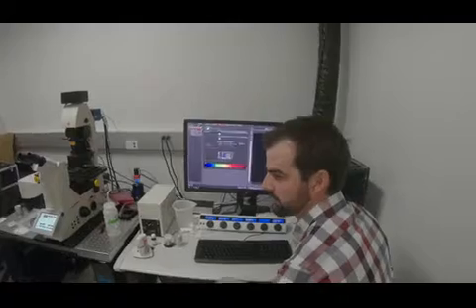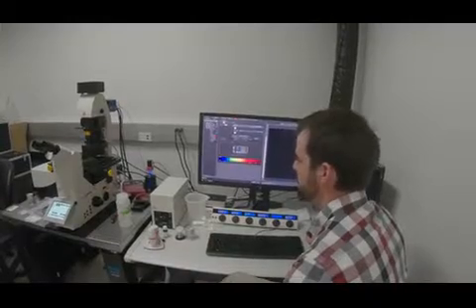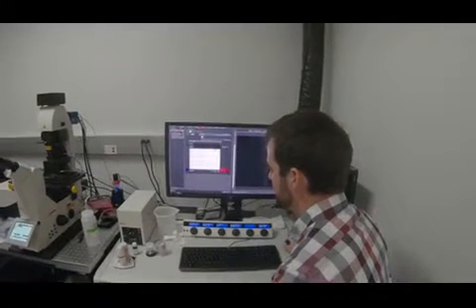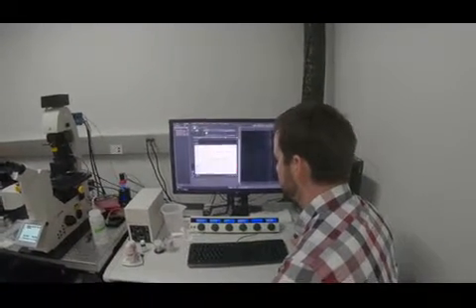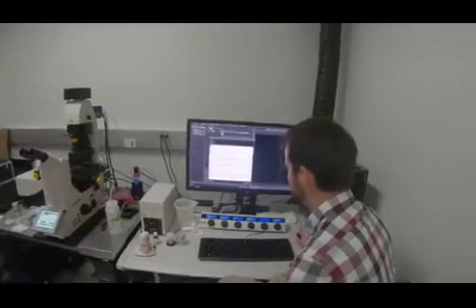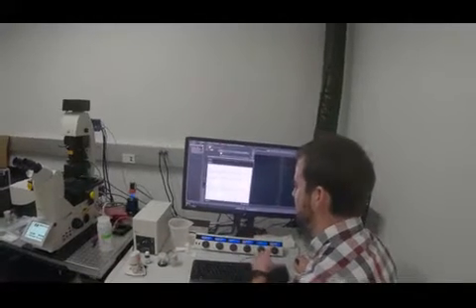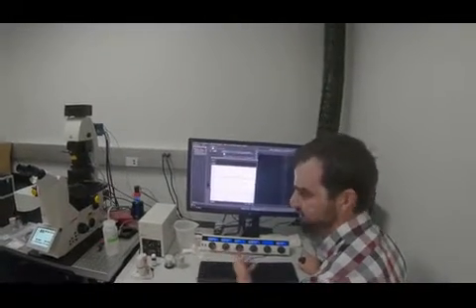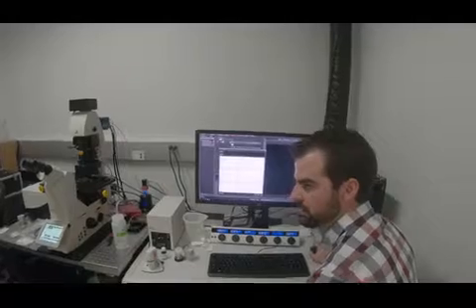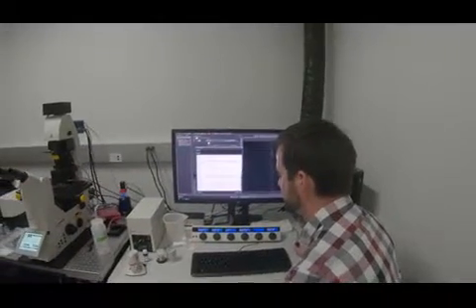So never delete the LIF file, because within each image in the LIF file, in this LIF format, is all the metadata for the image. So when it was acquired, start time, end time, X, Y, Z dimensions, pixels, voxels, and for confocal, all the confocal settings, lasers, detectors, everything about the image is saved here. I can apply the settings and I can recreate the image. All this data is not saved to the TIFF header because TIFF cannot handle this much data. It's only saved here. So definitely keep the raw data.